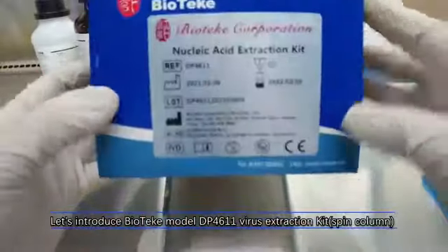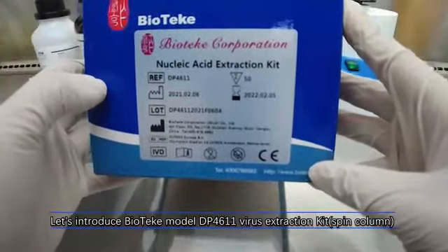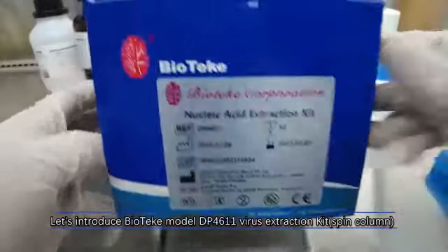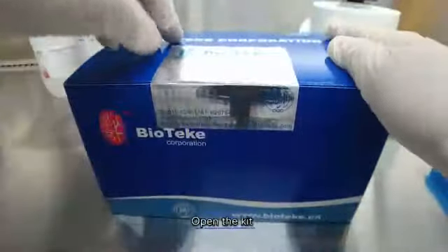Let's introduce Beotic Model DP4611 Virus Extraction Kit, SPING Column. Open the kit.